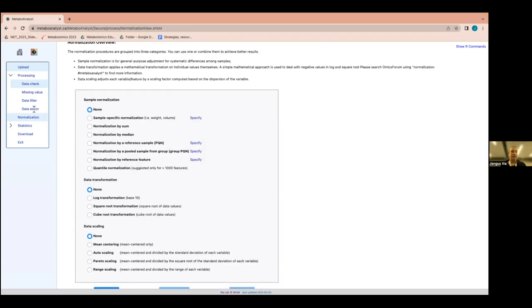On the left panel you can go back and look at missing values. Since we only have a few metabolites and it's targeted, by default we don't filter any out. If you wanted to apply a filter for a thousand or more features, you'd click that section. If you want to exclude specific features or samples, click the data editor button — but those are advanced options most people don't use. We go directly to the normalization page.